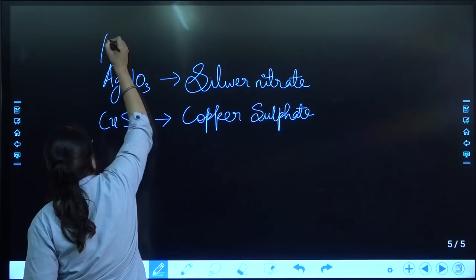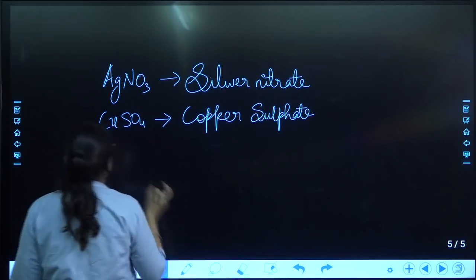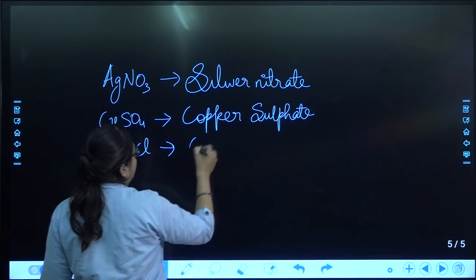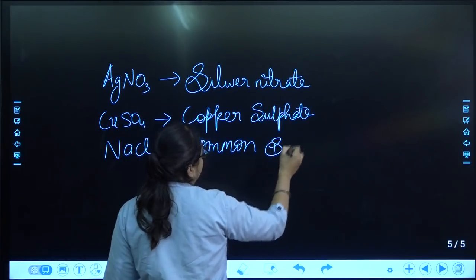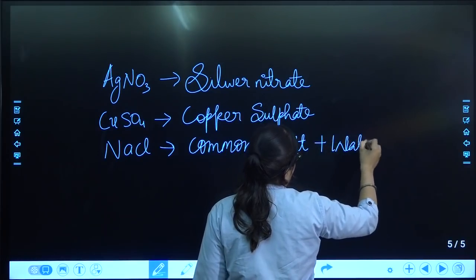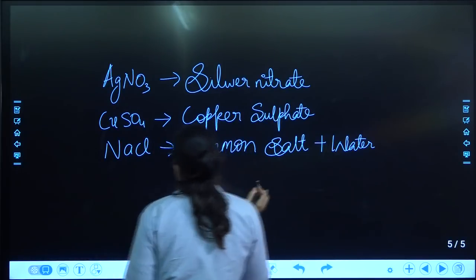NaCl, that is common salt. It will be added to the water. Water will be added to all except AgNO3.